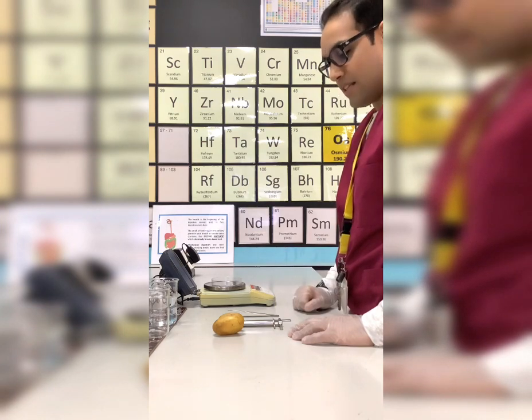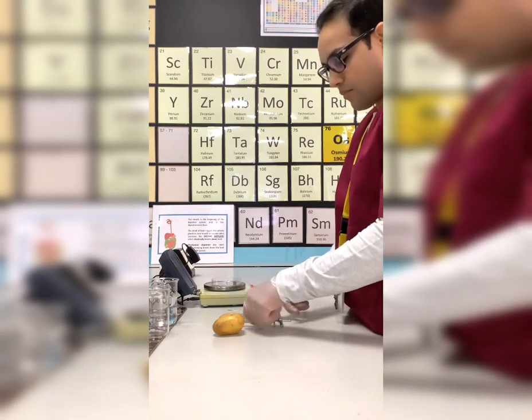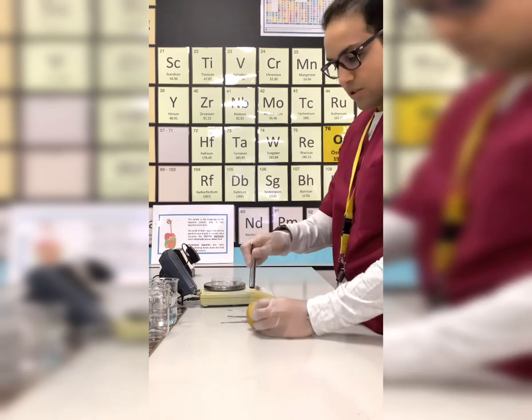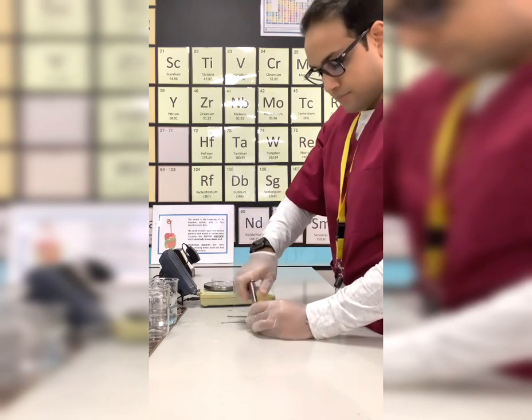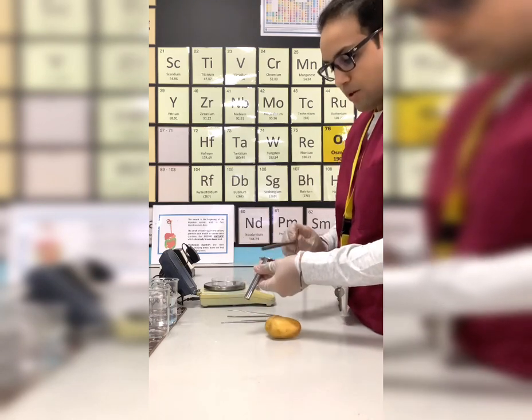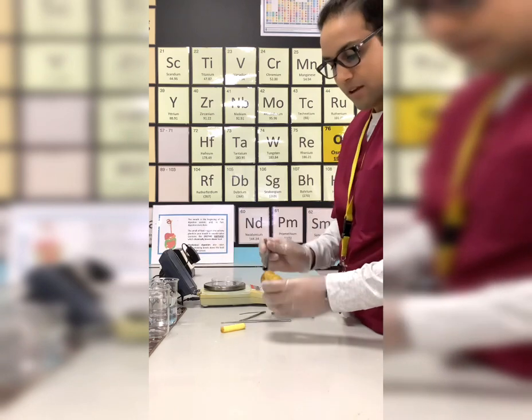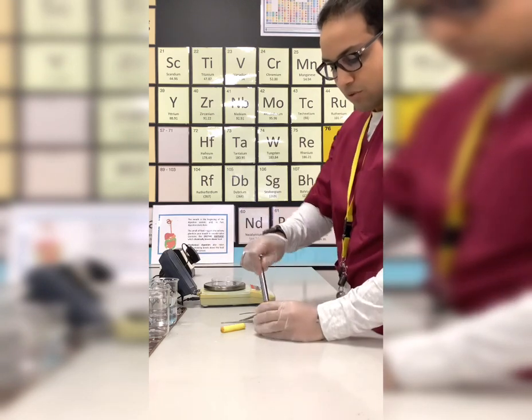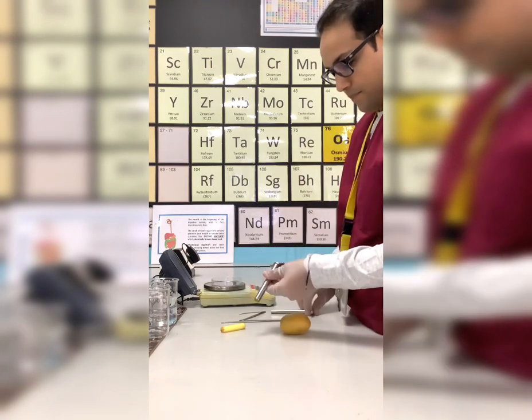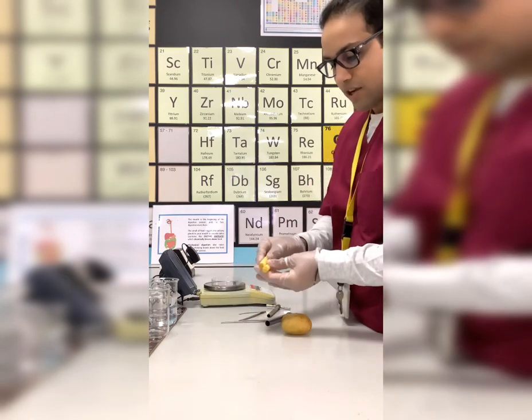So let's come forward and see the first procedure in doing our experiment. As we can see, I will be taking my cork borer and placing it into my potato as such. Since we need 2 samples, because one we are going to place in the distilled water and one we are going to be placing in the empty beaker, I have to take 2 samples of the potato. There you go. So now we have 2 cylindrical shapes of potatoes.